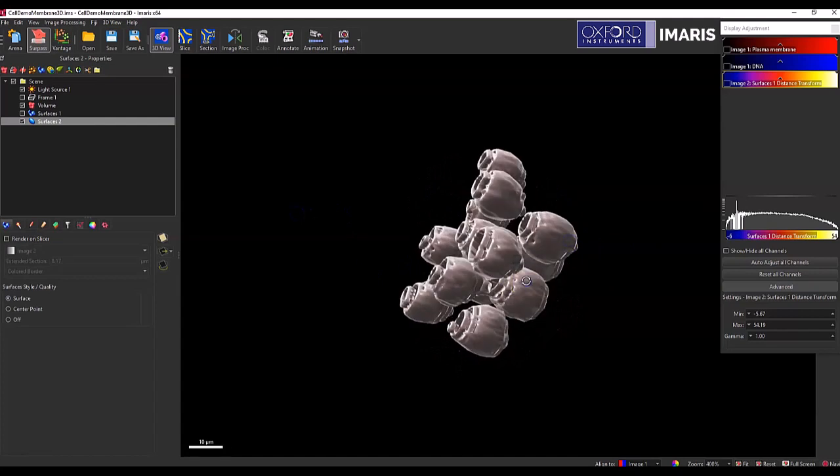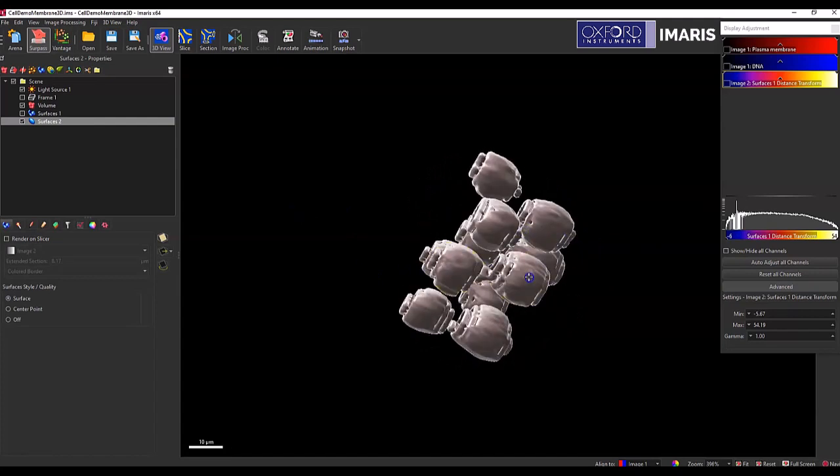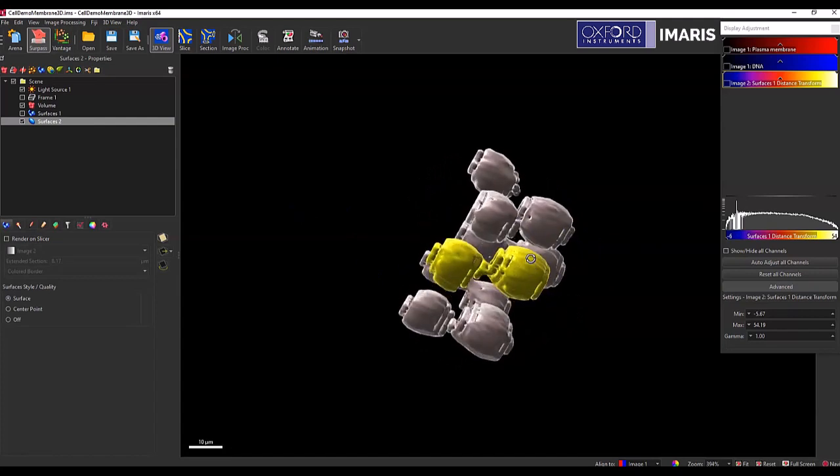And so right here, you can see that these two surfaces aren't actually considered one. So I could then manually cut these if I wanted to underneath this drawing tab.